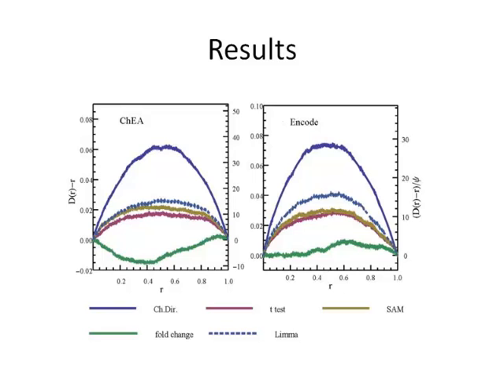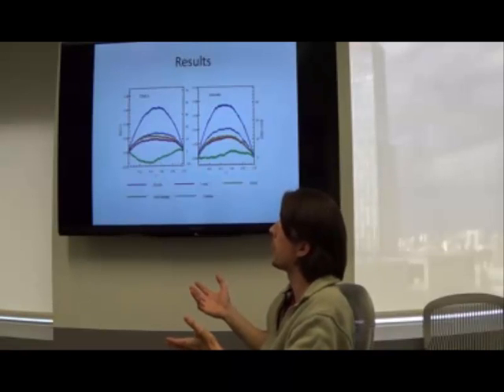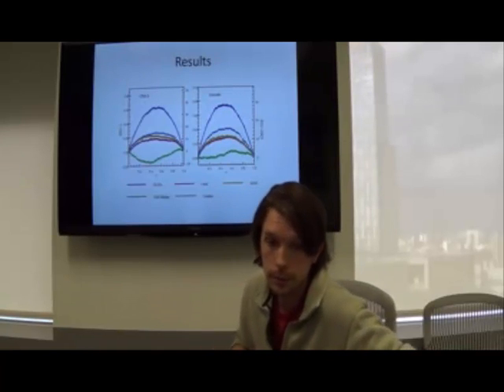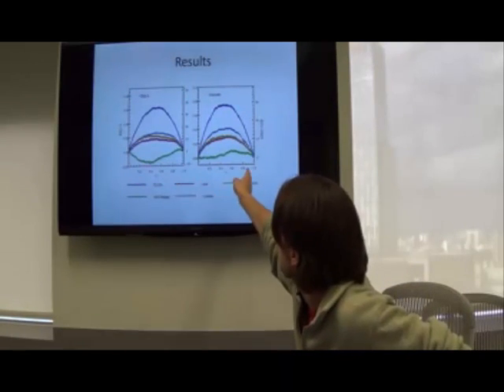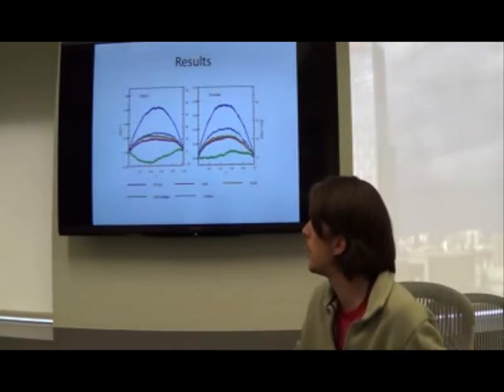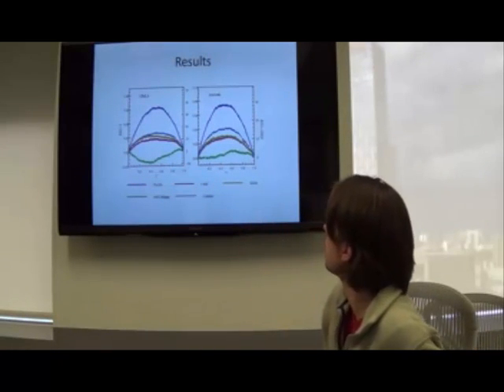And then where are these others? This dotted line, limma, is a really popular method. It's doing something; it's prioritizing the genes. And then here is the characteristic direction. This one, to a much greater extent, is prioritizing the so-called correct genes. Each one has two pictures here because we chose two different databases of ChIP-seq data, and we got similar results.